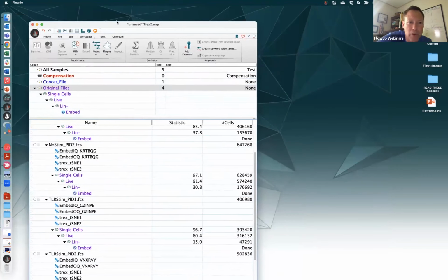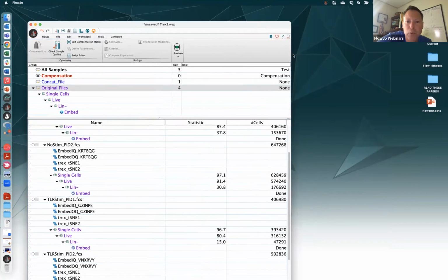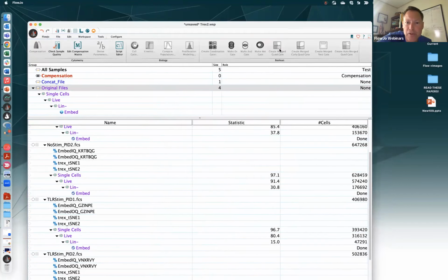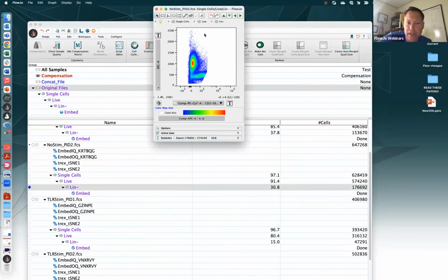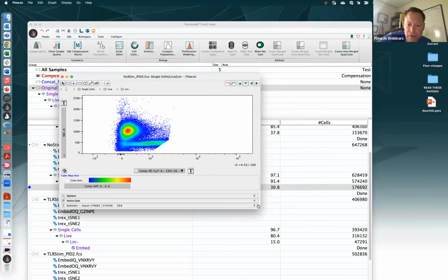I will just point to, if you want to make your own quad gates super fast, tools and booleans. Stretch it out, has all your new quad gate tools. Where the gist of this is essentially, I guess I can do a really quick demo on this in a minute, and then still leave a little time for questions.